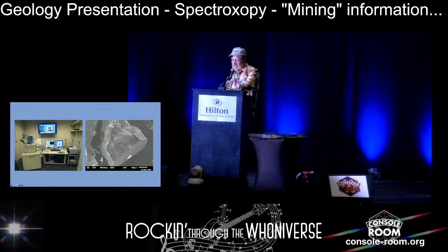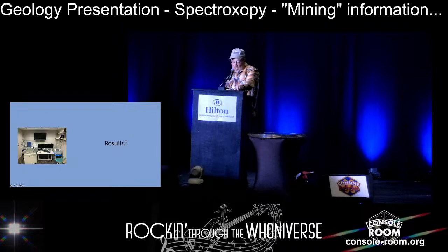So right now, I have the sample over in the chamber, and we're going to zap it, and we'll see what we get. What is it? So chabazite can be a potassium variety, it can be calcium, it can be sodium, or some combination of those, and we get something we call solid solution, where we can get mixtures of specific cations that fit into specific sites. The X-ray didn't tell us necessarily which of those was.